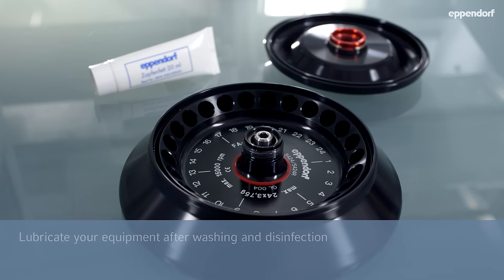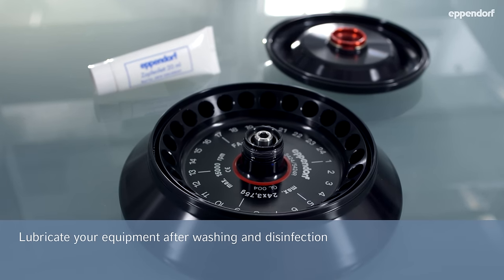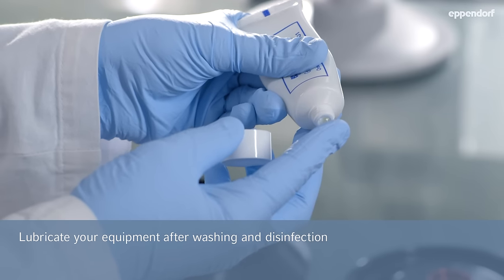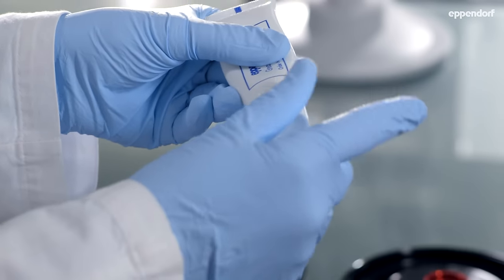To lubricate bucket grooves, pivots, rubber seals and threads, place a small amount of centrifuge lubricant onto your finger.